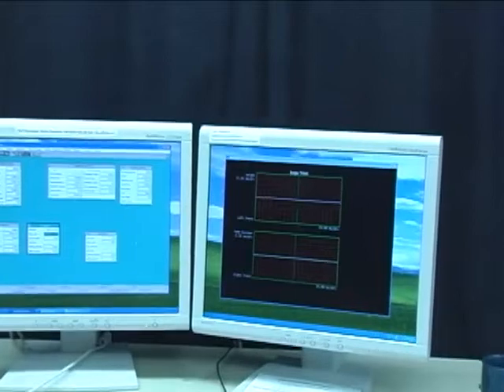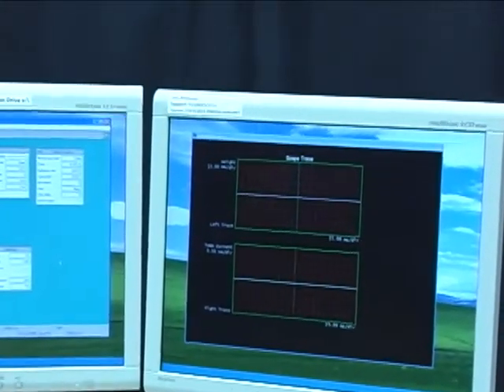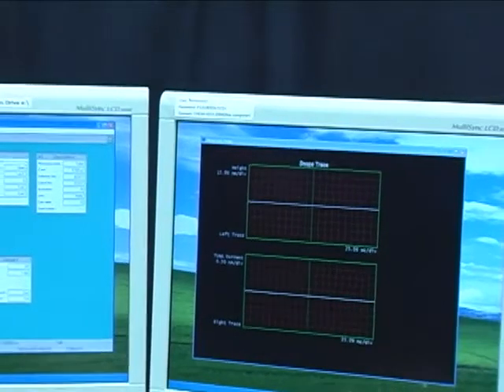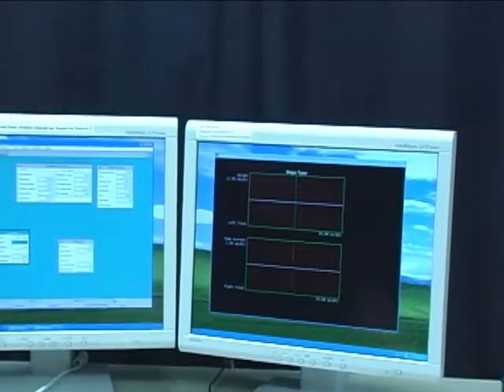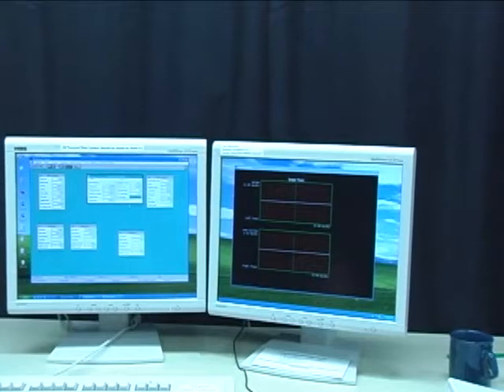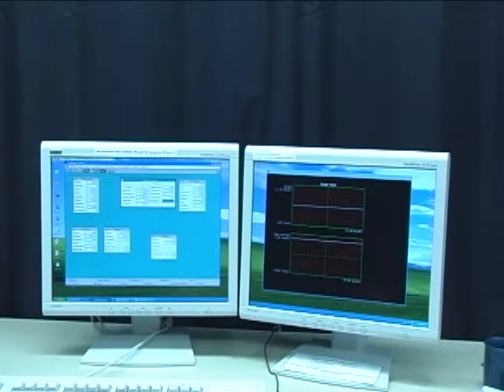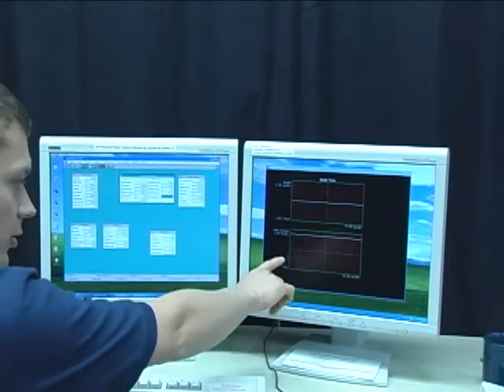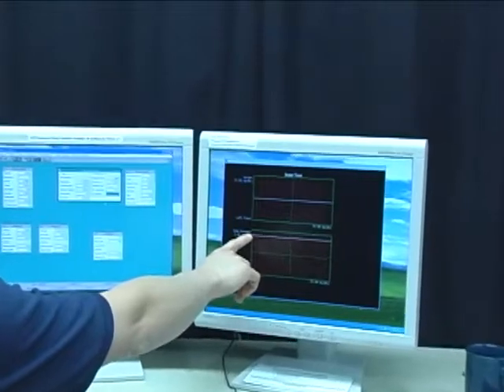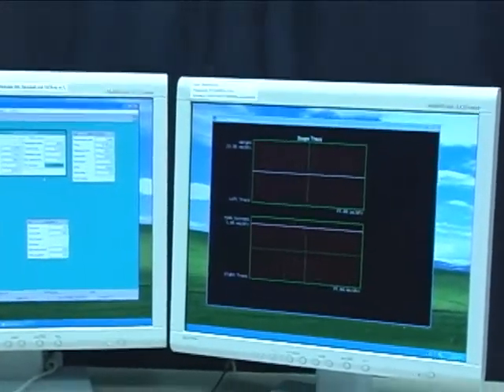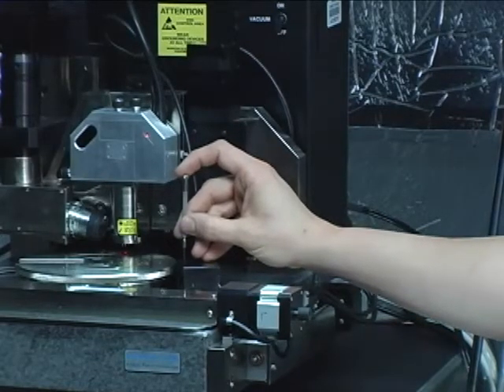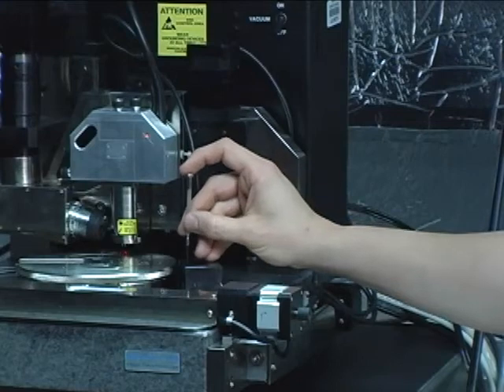Now the current reads zero and the zero offset is correct. So we'll now set the slope of the amplifier by applying a test bias across the resistor. So we're applying 4 volts across our 1 giga ohm resistor which should give us a current of 4 nanoamps. So we're slightly under that and we will adjust the slope of the amplifier's response using our screwdriver again.